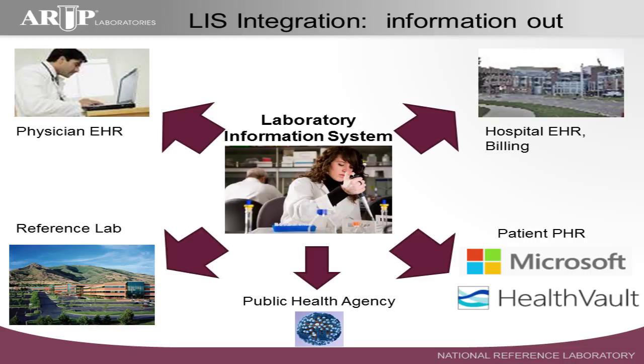That's the challenge of practicing medicine across the country. You get to deal with the different states' regulations. So we have a lot of information exchange with the different state health agencies, and sometimes with county health agencies, and sometimes with city health agencies. So it's a challenge because they all want it in a different format, in a different way, and a different timing. So we have to deal with all that. But it's a very important part of laboratory information exchange.